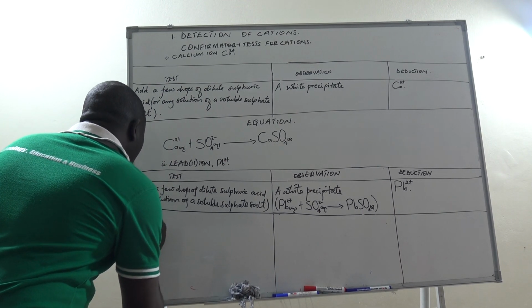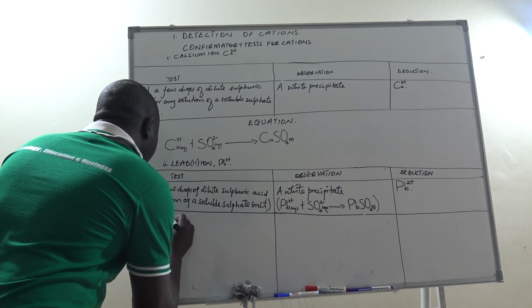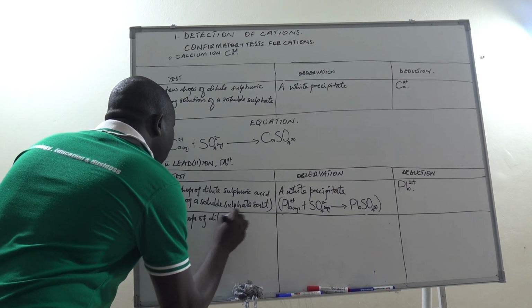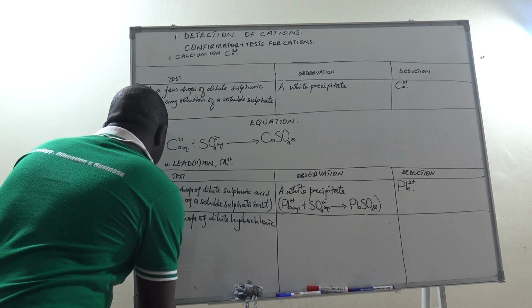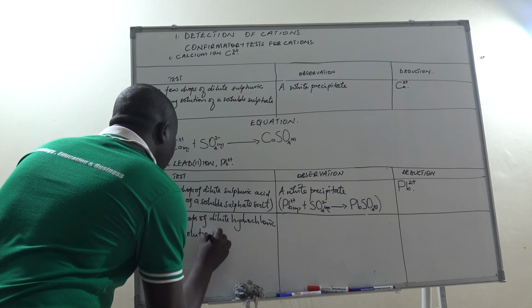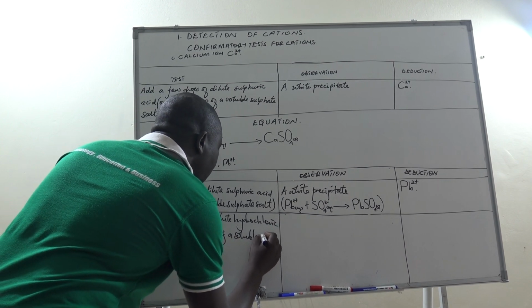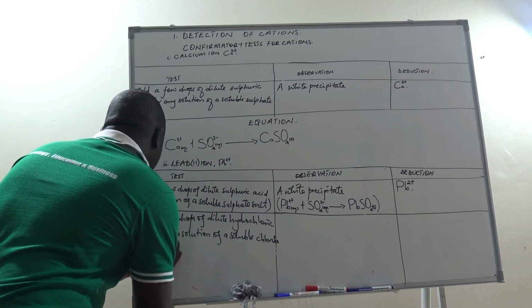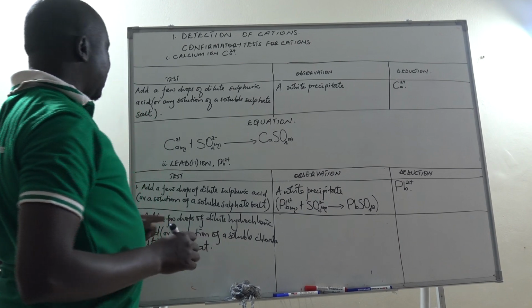Then next, we can also be asked to add a few drops of dilute hydrochloric acid or a solution of a soluble chloride salt and heat. Okay, let us see what takes place here.